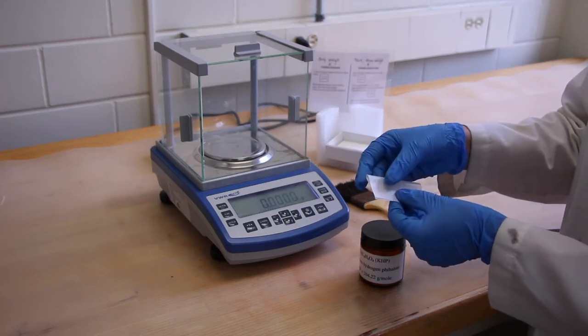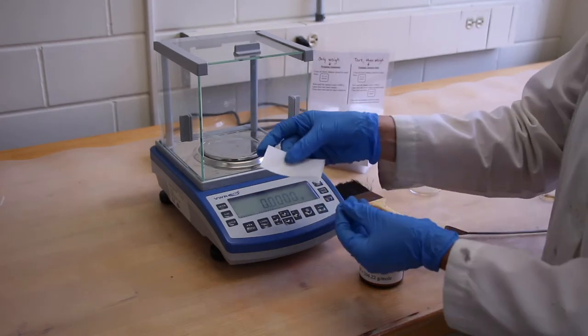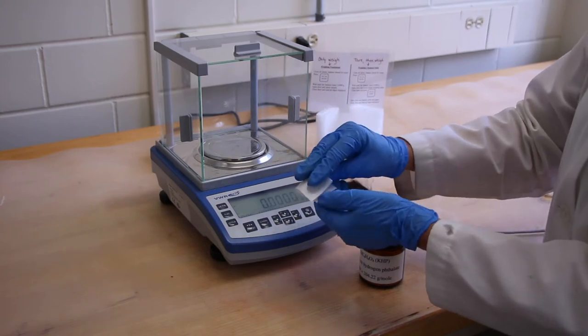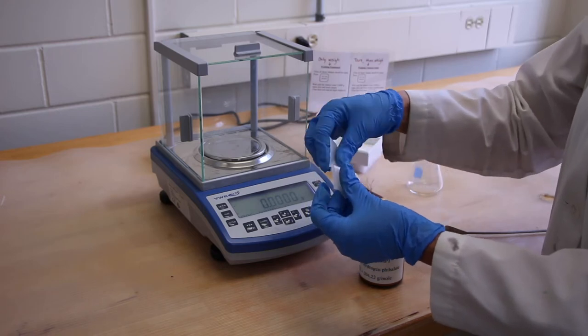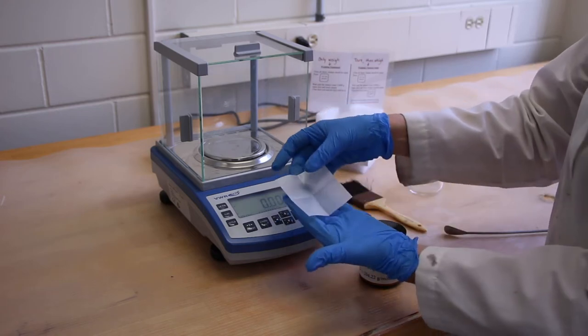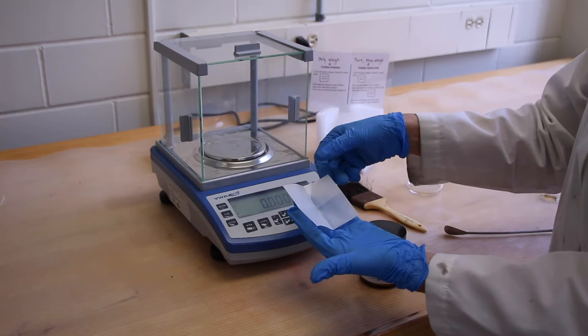And good technique is first fold your weigh paper in half, and then in half again. So that when you open it up, it does not lie flat.